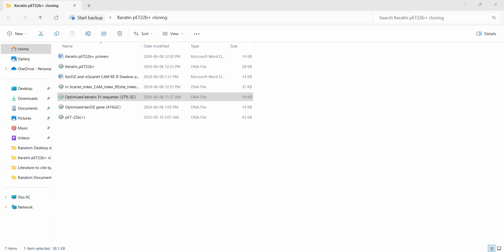PCR. This might be slightly harder, and PCR gets to be not so easy and long, because think about that, you are amplifying a size of 5,493 base pairs. That is the size that you are expecting to see on gel after PCR amplification.